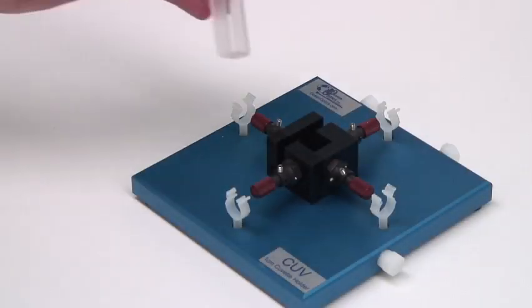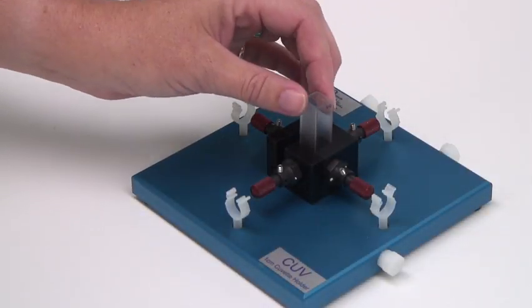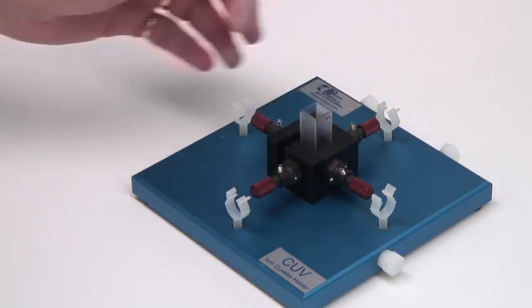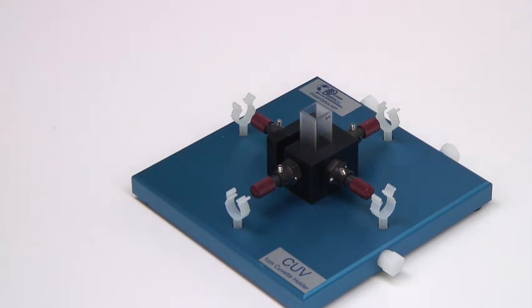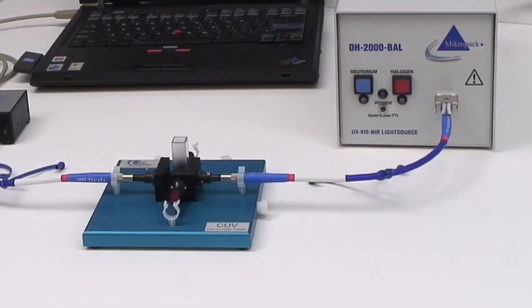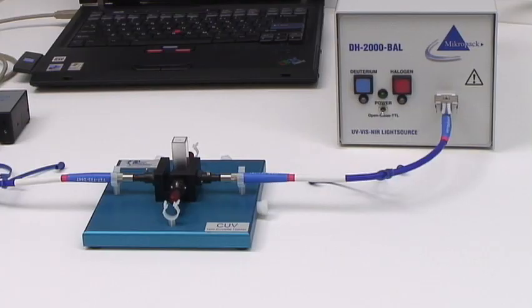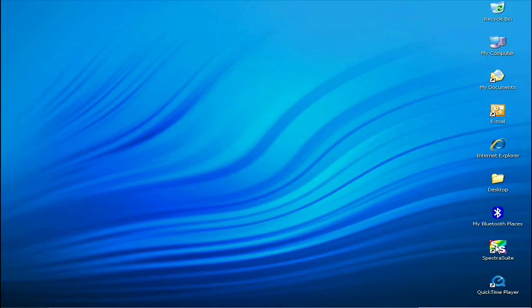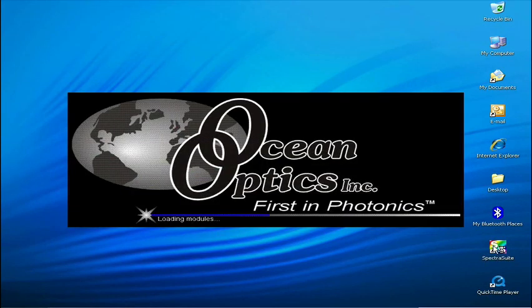Insert an empty quartz cuvette into the cuvette holder. This will be our reference for the absorbance measurement — this is sometimes called the blank. We will be working in a processing mode of SpectraSuite. Processing modes are where you make absorbance, transmission, reflection, and irradiance measurements.